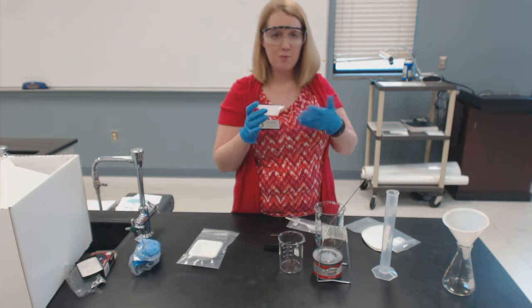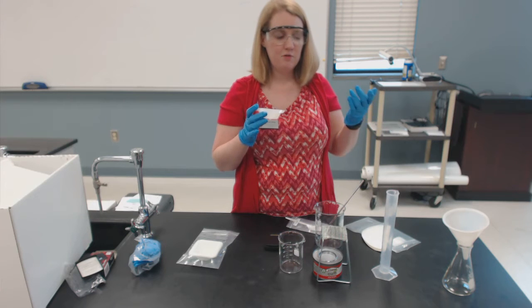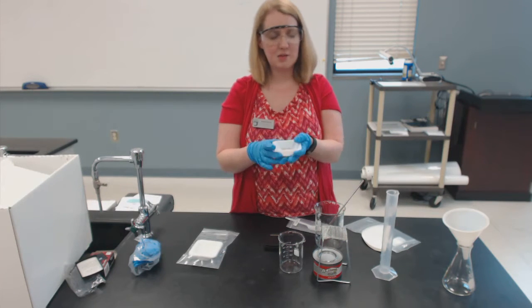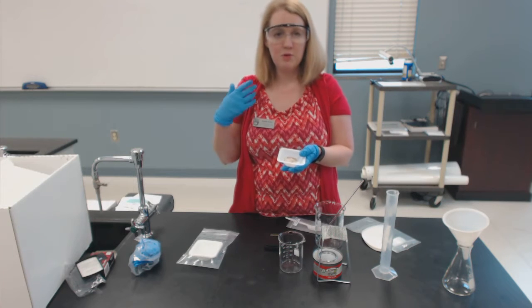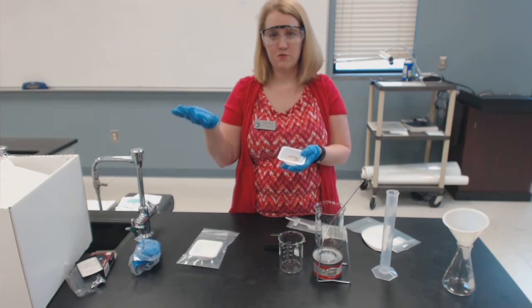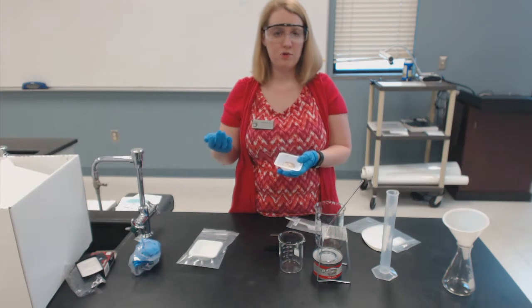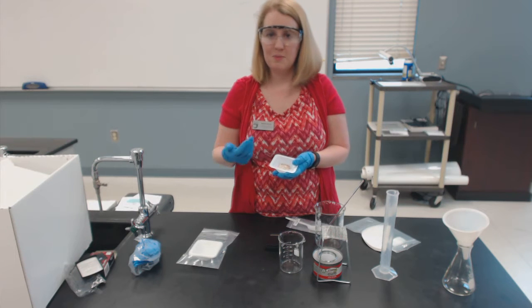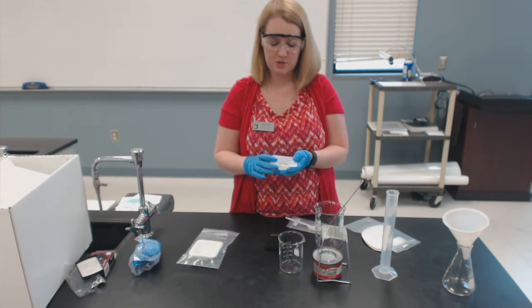So you have to come up with your own method of which component you're going to remove first, and there's more than one way of doing this. I do this exact same experiment here in lab with my seated class students, and they all come up with different methods for doing it. If you want to, before you do the experiment, send it to me in an email and ask for my feedback. I'd be happy to give you feedback on your procedure.